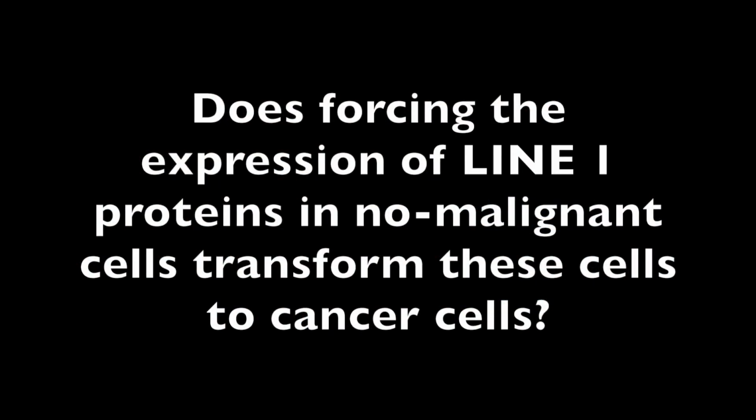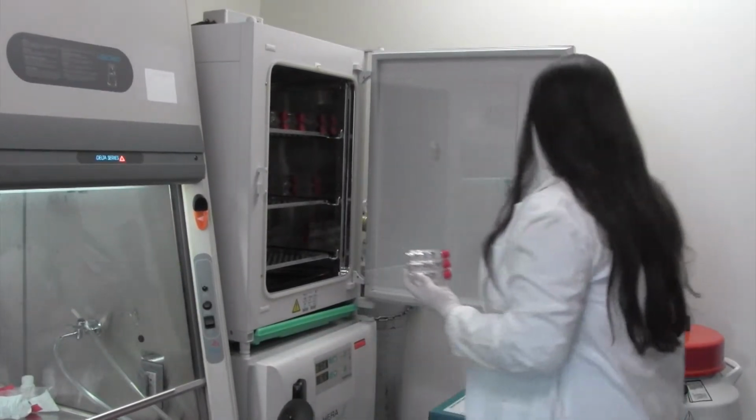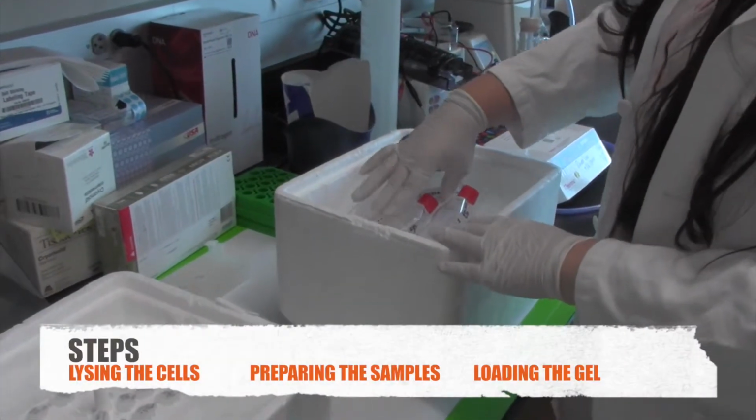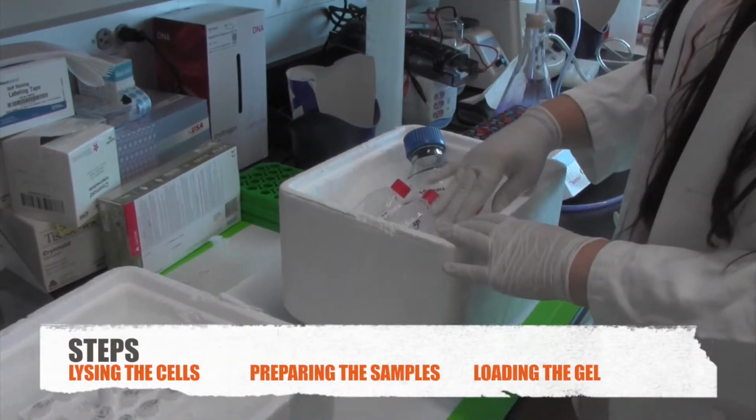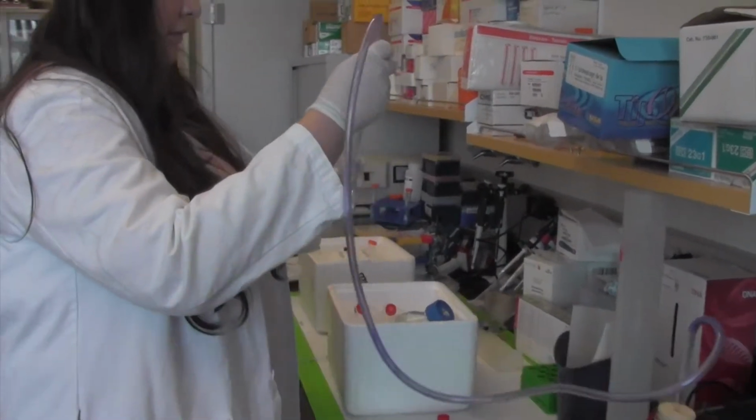Does forcing the expression of line 1 proteins in non-malignant cells transform these cells to cancer cells? We begin by taking culture lung cells out of the incubator. We are going to demonstrate lysing the cells to extract protein, preparing the samples and loading the gel.